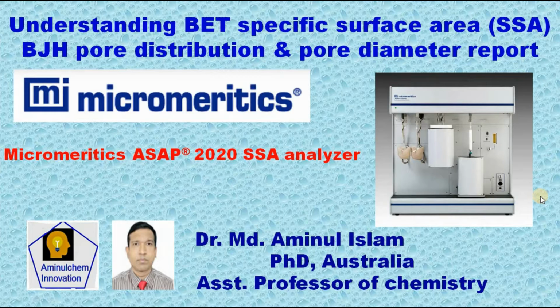In this video, I will explain how to understand BET specific surface area, BJH pore distribution and pore size report. In my previous video, I explained what specific surface area is and how to plot the BJH pore size distribution curve in Origin. In this video, I will explain these results, which have been taken from a Micromeritics ASAP 2020 specific surface analyzer.